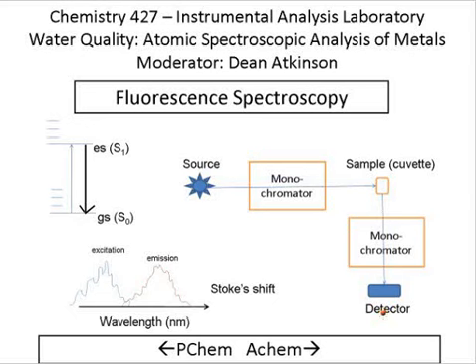We can put the detector here. We can put the detector here. We can put the detector above or below. We can even put the detector back where the source is or over here on the other side. It turns out there's only two wrong answers. Putting the detector where the source is a bit of a problem because they share the same space. Putting the detector on the other side of the sample is really the worst possible place to put it, and that's exactly where we would put it for an absorption spectrophotometer.